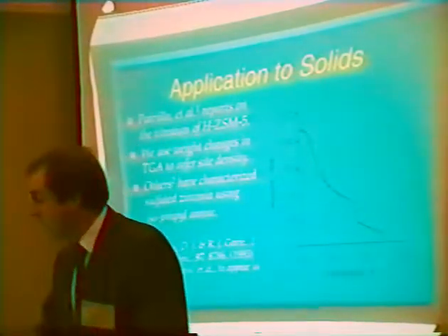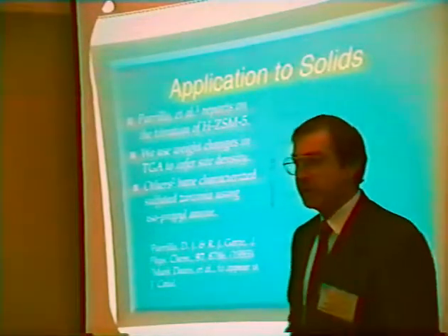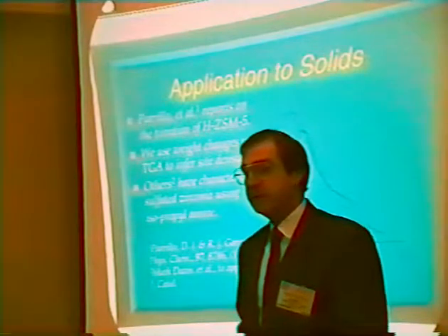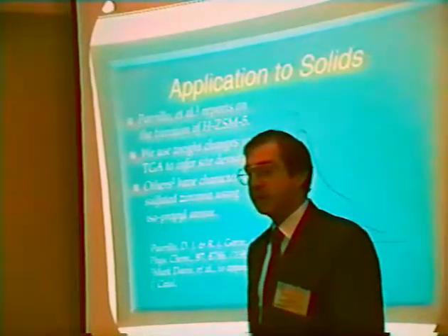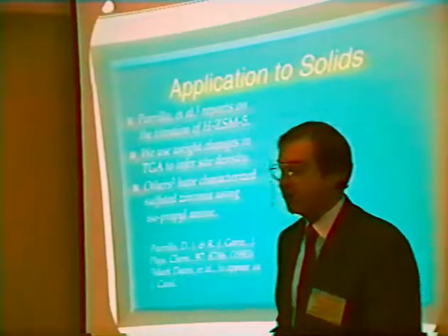Now, we're not the first to have done this. Mark Davis has a paper coming out soon, in which he in fact did the same thing. He did not use a TGA to measure the extent of reaction. He measured the production of the olefin in the mass spectrometer.